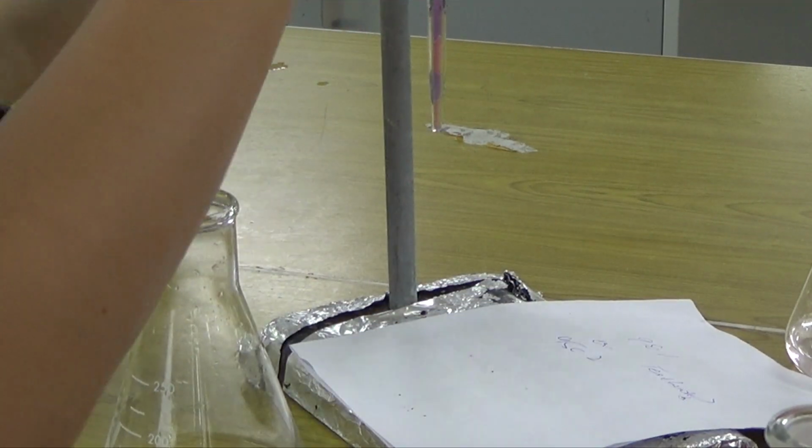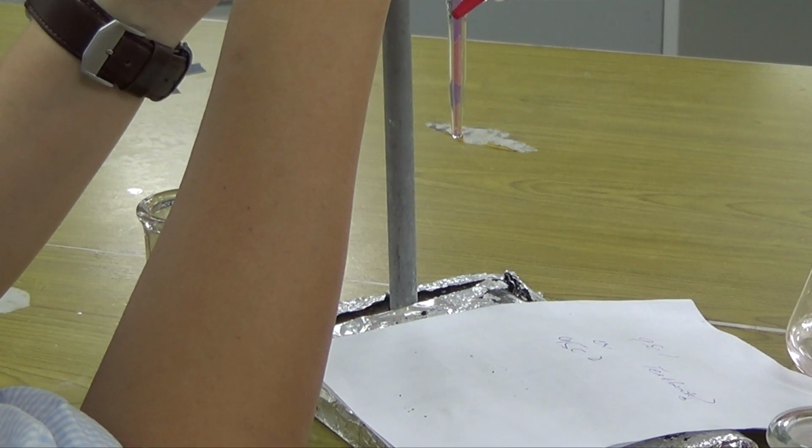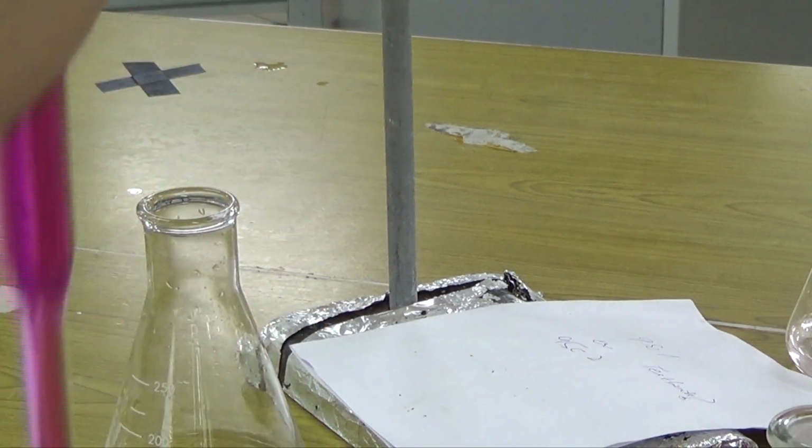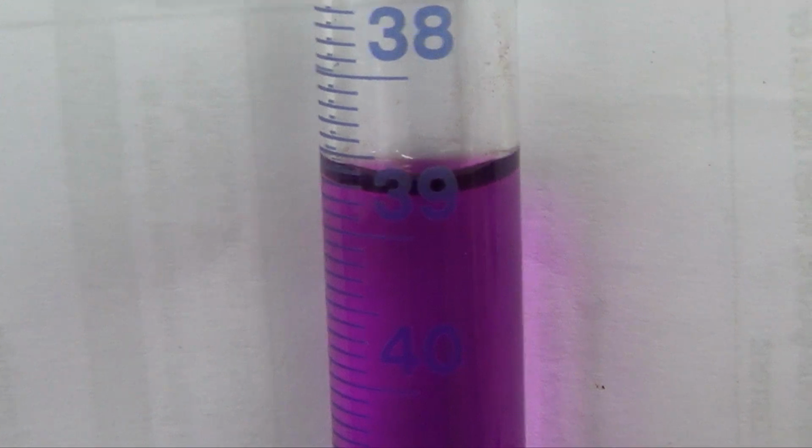But let me just read the reading first, because that's important. If I read above the meniscus, there is 38.6. And again, there's some sort of margin of error. If you don't think the color is that obvious, then you can go a bit further. 38.6, yep, that is what my reading is.